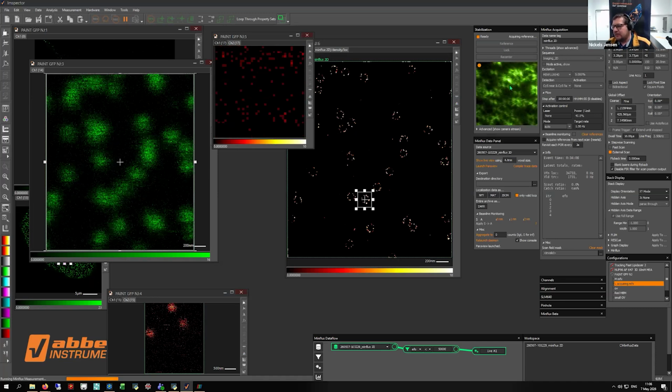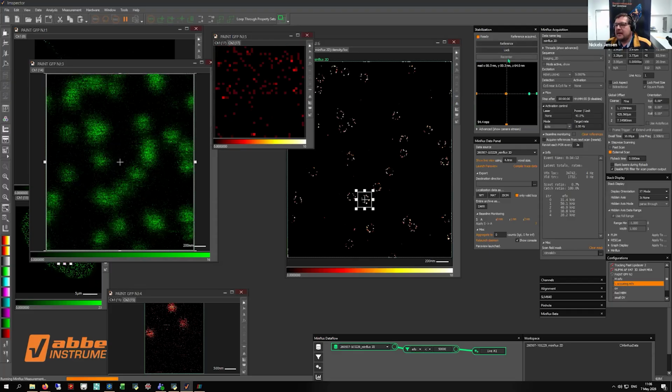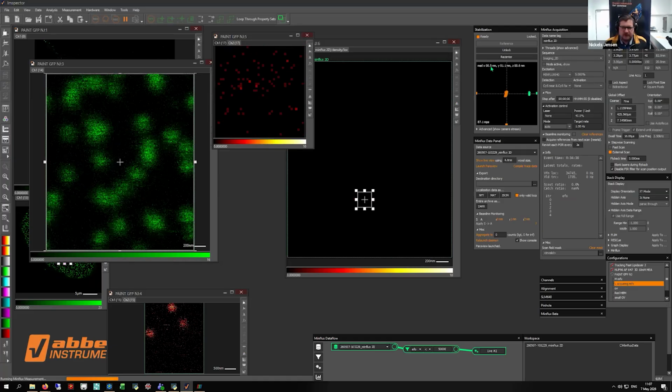Now it takes a position, it sees the reflection pattern, and then you see how this normal drift is. Then I can lock it, and then it's stabilized. And here you can see with which stabilization this is localized. So it corrects with a precision of below 1 nanometer. And if I now hit the microscope a bit less hard, but just produce small vibrations here, you see that it also always directly corrects this.